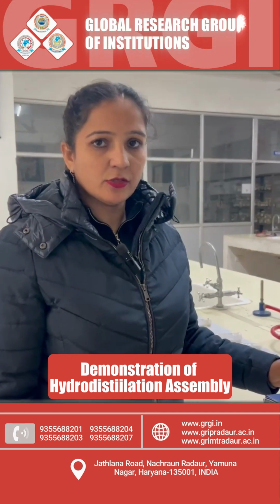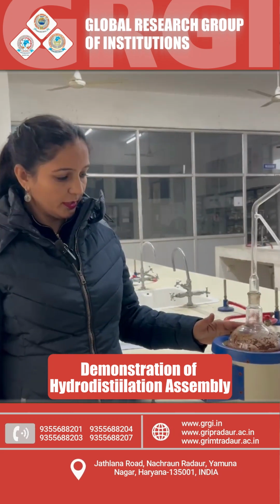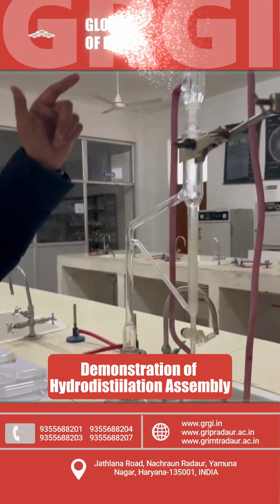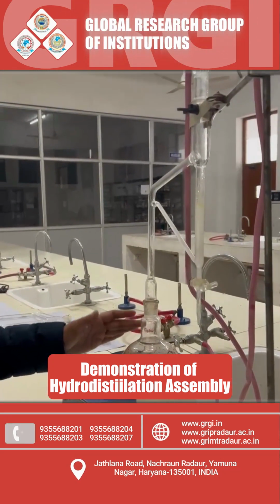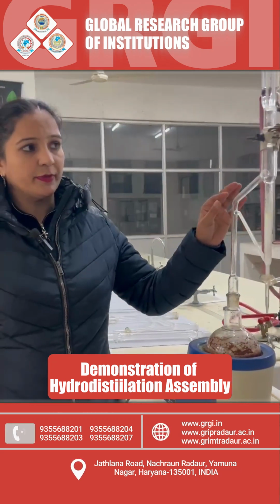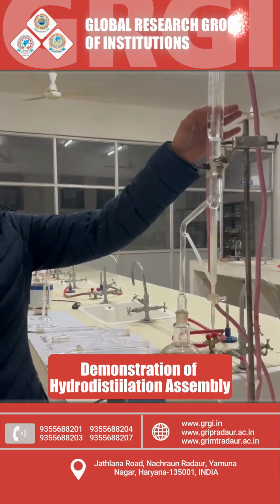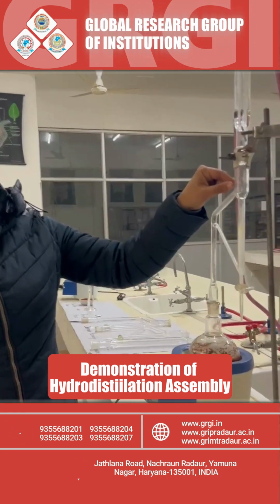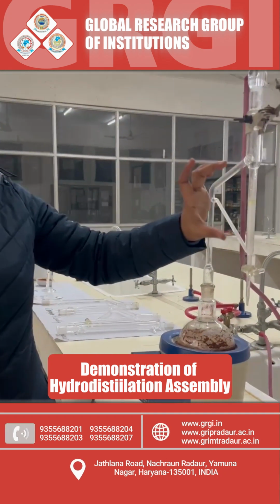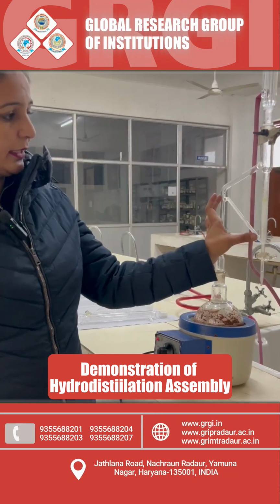One of my assemblies is already running here. You can see here the water is boiling along with the crude drug and vapors are flowing freely in a single direction. Please note the vapors contain both water as well as volatile oil, and as the vapors are lighter in weight, they directly go to the condenser. The condenser condenses the vapors into liquid and that liquid trickles down inside this graduated tube in the form of droplets. This graduated tube is connected to a tilted tube.